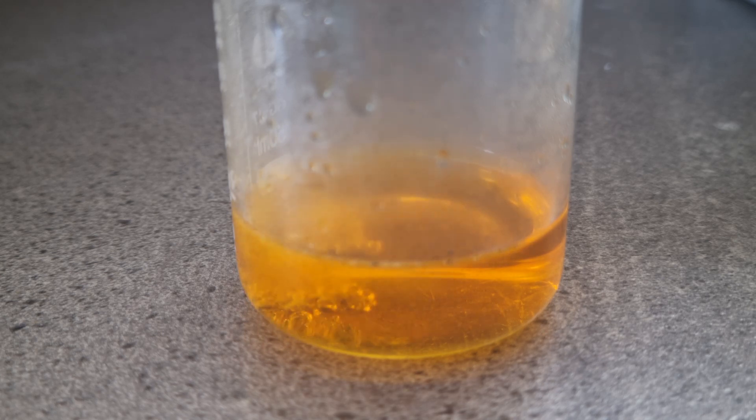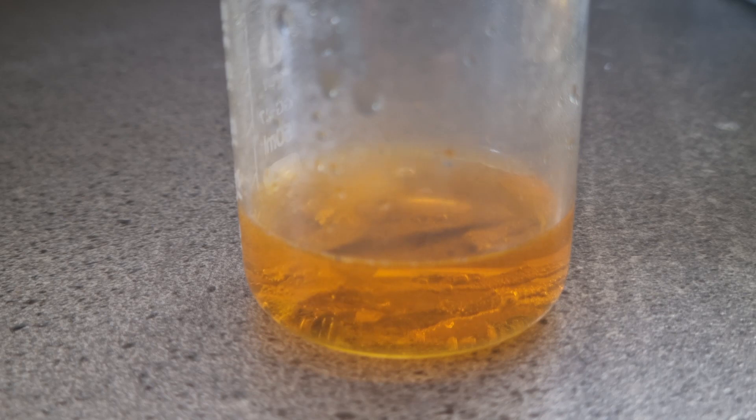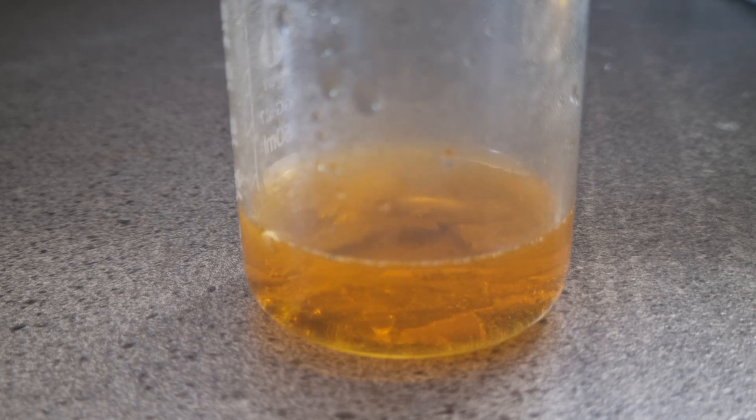As the zinc metal reacts with the hydrochloric acid, it consumes the acid, producing zinc chloride and hydrogen gas. The produced hydrogen bubbles through the solution, slowly reducing the chromium 6+.